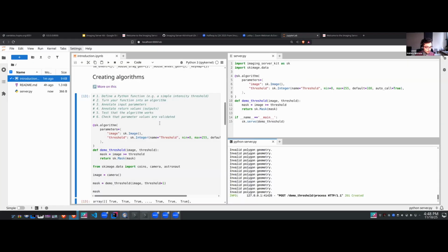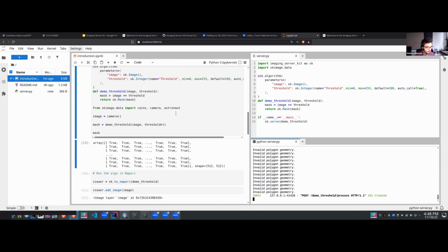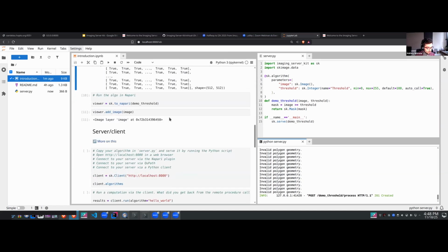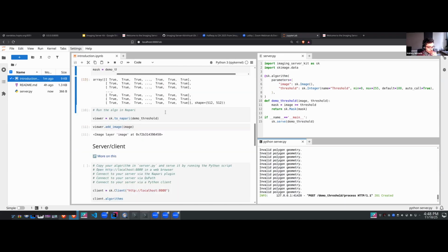I see that we have pretty much about 10 minutes left. Let me see what else I had planned to show you today. So the server, yeah, maybe this.